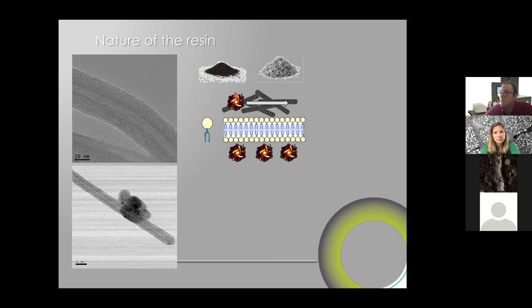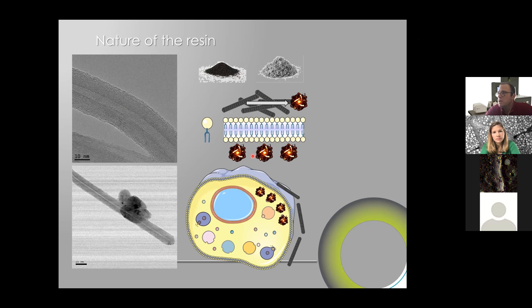So basically the idea is the following: the electrons will be gliding over the carbon nanotubes, but since the carbon nanotubes cannot enter through the plasma membrane, the electrons that are inside will remain stuck and will somehow charge. And that's what we see in the scanning electron microscopy process. So the idea would be that your cell would remain charged inside while it discharges outside. That's an option, but that's not sufficient for what we were looking for.